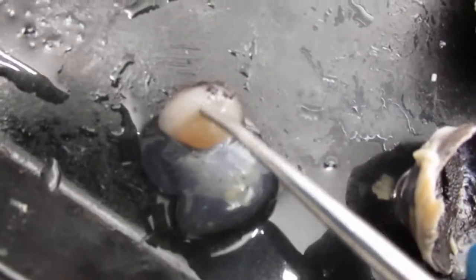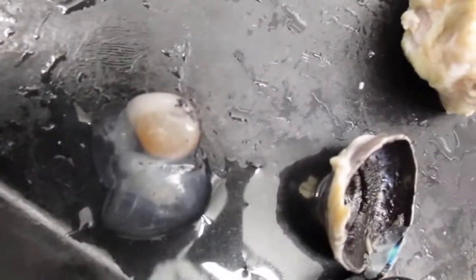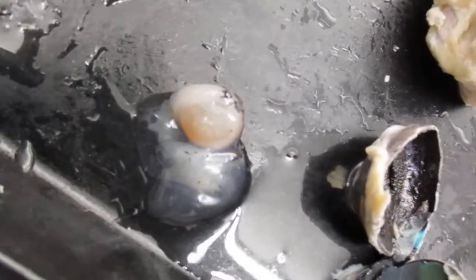Okay. Now, you have the lens, which is clear in a normal specimen, human eye or sheep eye, and it's going to be controlled by parasympathetic as well as sympathetic innervation.